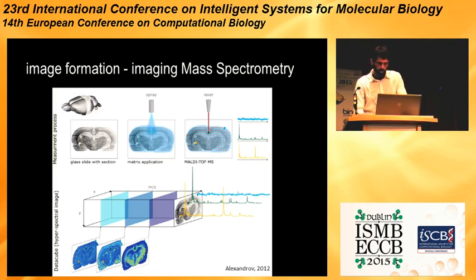And within these data sets, most of the channels correspond to some kind of noise. Very few actually show structured distributions. So even though you have somewhere between 50,000 and 1 million individual mass measurements, there are typically more like a few thousand useful analytical images in there. The typical way of finding these is you get a mass spectrometrist and they click through every single image in the data set, determining whether or not there's a useful distribution there. Obviously this isn't a particularly pleasant process for the mass spectrometrist. It's time consuming and it delays the speed to any sort of analysis of the data.